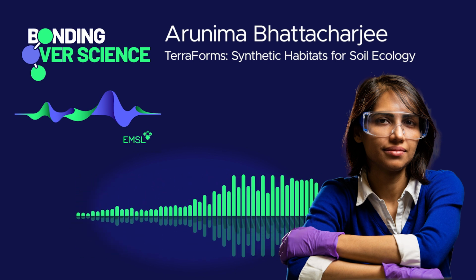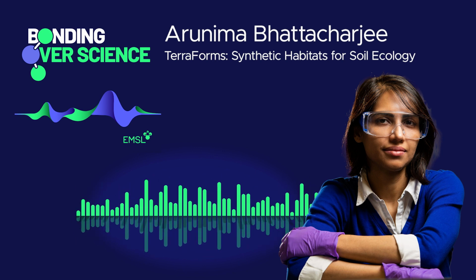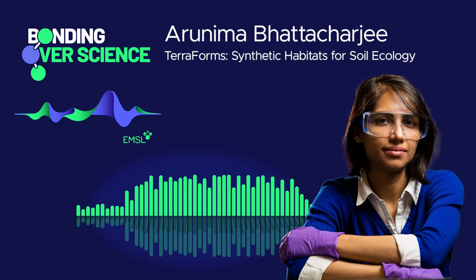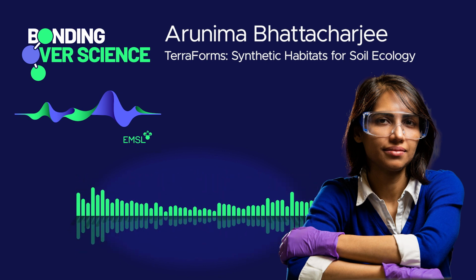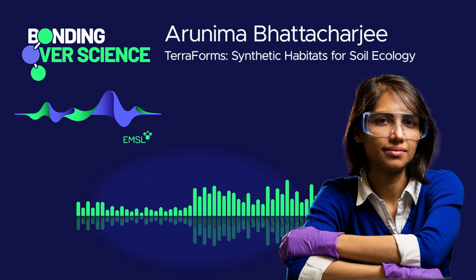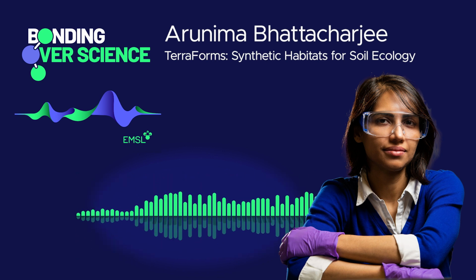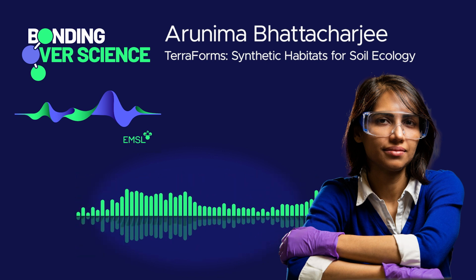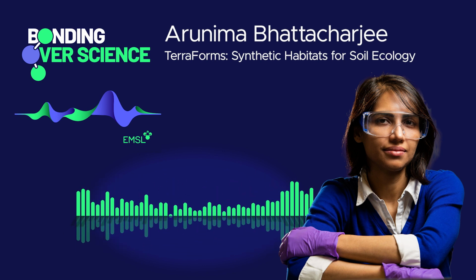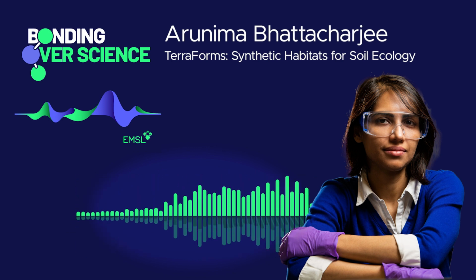So just to give a summary, mass spectrometry, which includes all the techniques that I talked about, MALDI, nanoDESI, SIMS, TOF-SIMS, NanoSIMS, we can do SEM on them to visualize what kind of changes are happening on the surface of the minerals, how the fungal hyphae is growing within these soil pores. We have not done transmission electron microscopy on them because you need a very thin substrate. We have collaboration with SSRL, where we use different synchrotron-based techniques like XANES and X-ray fluorescence to understand the chemical changes occurring within these minerals, the chemistry of different inorganic nutrients being taken up by these microorganisms.